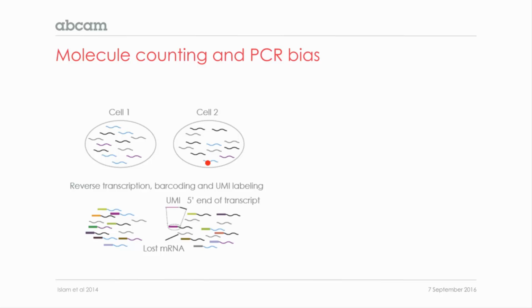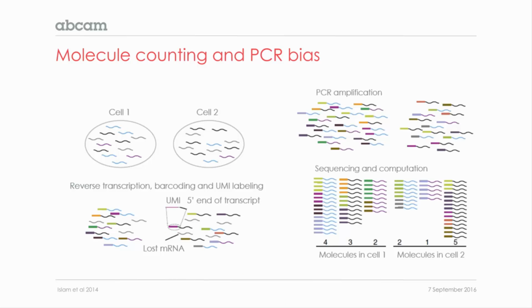So we do lysis, reverse transcription, and the amplification, and again, the amplification is not perfect, so we amplify it, and we get the PCR product. And then remember that the blue molecule represents a single gene. But if you look at the labeling, this blue molecule got the green tag, while this blue molecule got a gray tag. And here again, each blue molecule got a different tag.